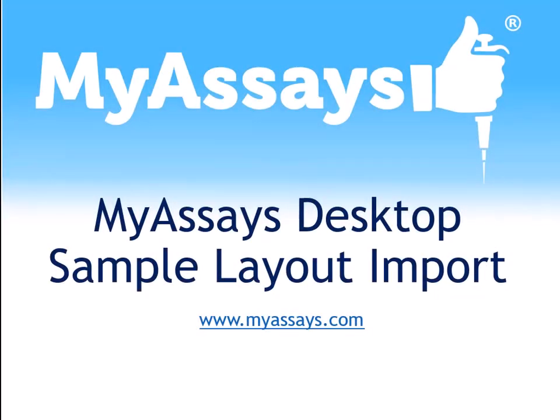In this video, I'll show how MyAssays Desktop can automatically import sample layout information into an analysis as part of an automated workflow. This allows sample details such as type, standard, control, blank, etc., position, and replicate information defined in a file to be seamlessly imported and applied within MyAssays Desktop.